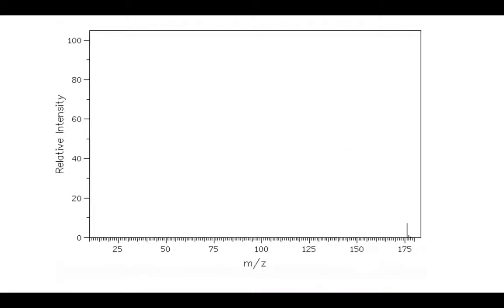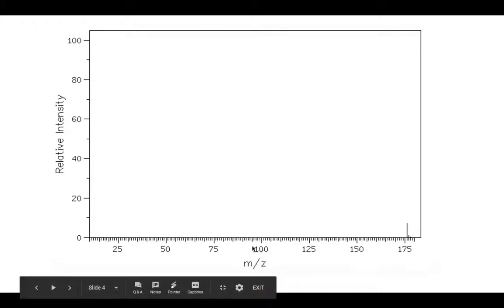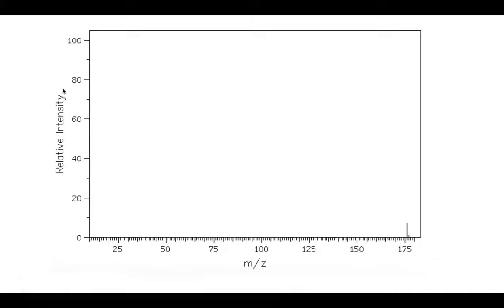The readout that we're going to see is this one here. It's got the mass down in the bottom, and it says m/z for mass-to-charge ratio, but we can just think of that as mass, since the charge is always going to be 1, so the mass-to-charge ratio would be equal to the mass. And the relative intensity here is going to tell us pretty much how often something of that size hits the detector. And we can see our values down here, 25, 50, 75, 100.